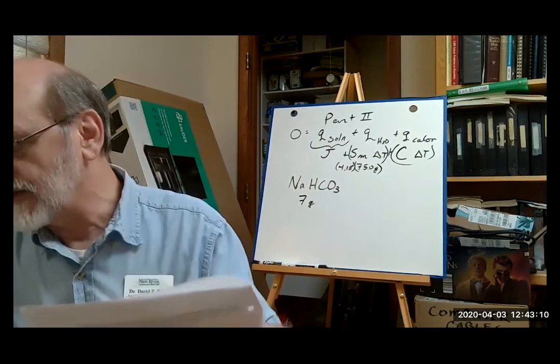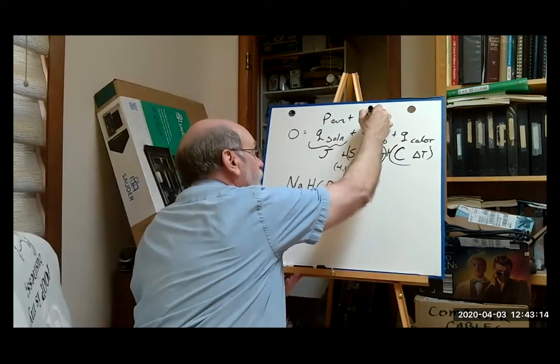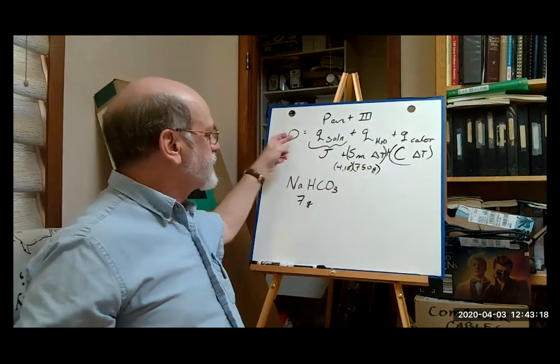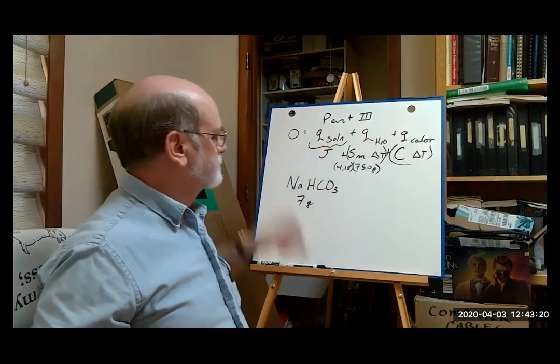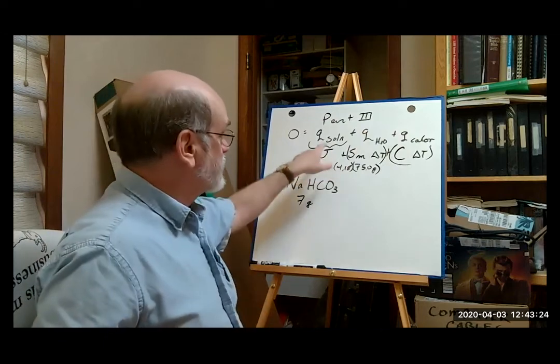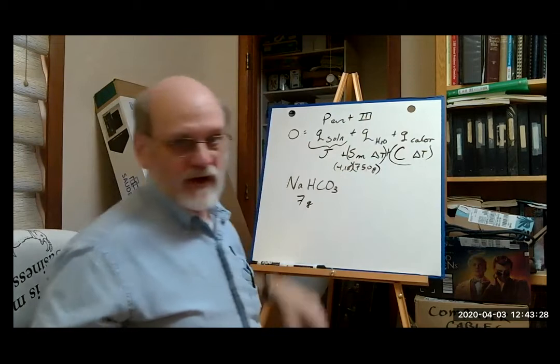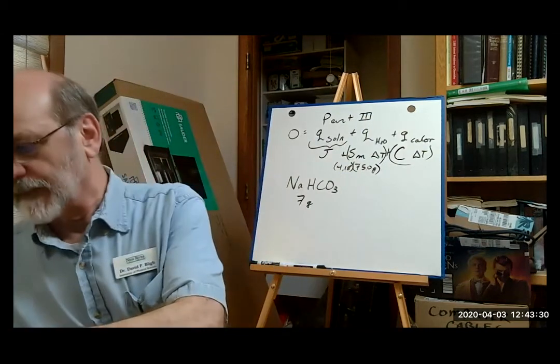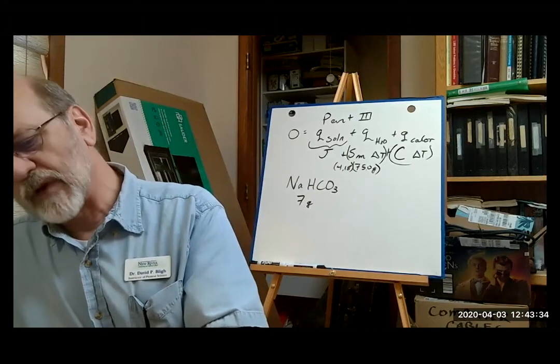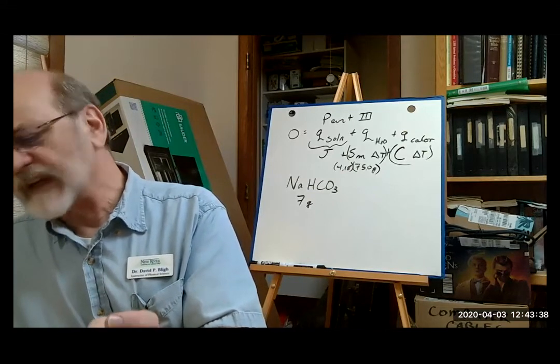And I believe that was part 3. There you go. So part 2 and 3 use the same arrangement here. The only difference in part 1 is this is Q of neutralization, but these are similar terms. All right, let's see what else needs to be done. There were no discussion questions that we needed to go over.